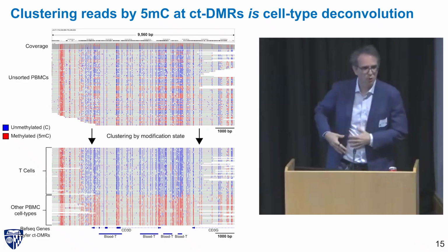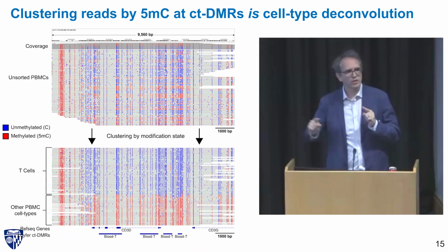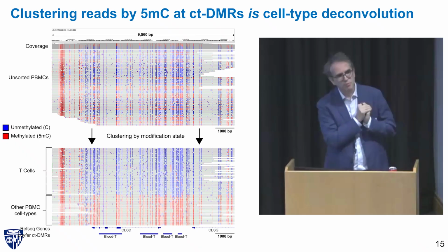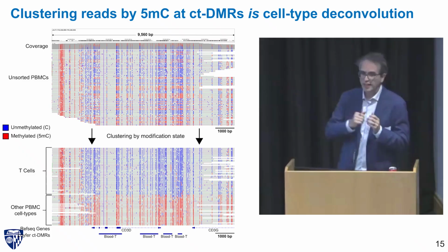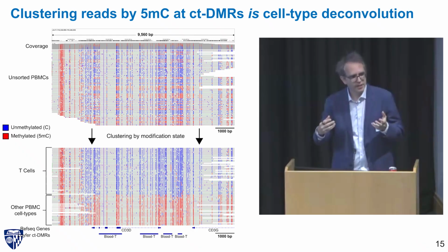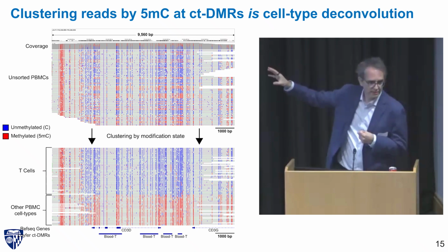If you look at your colon and you look at different crypts in your colon, you can figure out which cell belongs to which colonic crypt, because the noise in the methylation of the stem cells gets relatively replicated up through the whole crypt. So some of that is real. Is it biologically meaningful or functional? That's a different question. When we're trying to cluster according to cell type here, we're generally looking regionally. We can smooth out small variations because we're looking regionally to see, oh, this whole thing is different in this area.